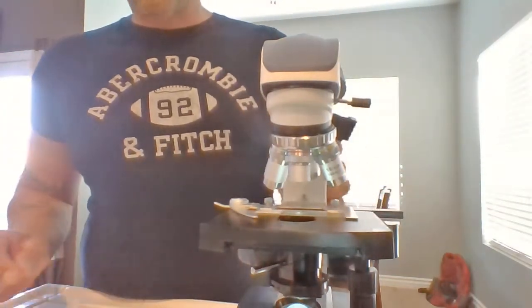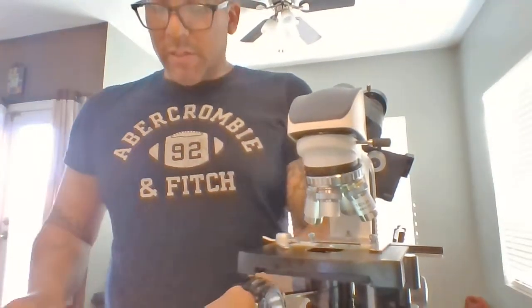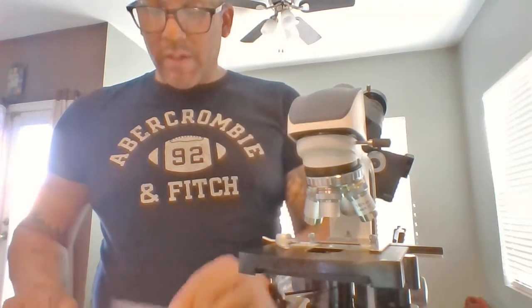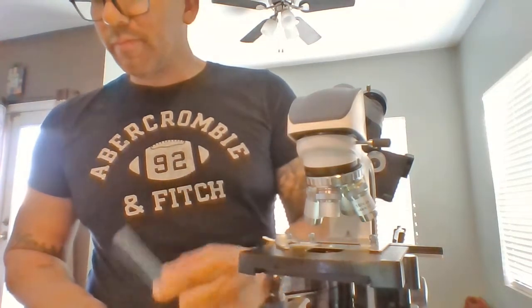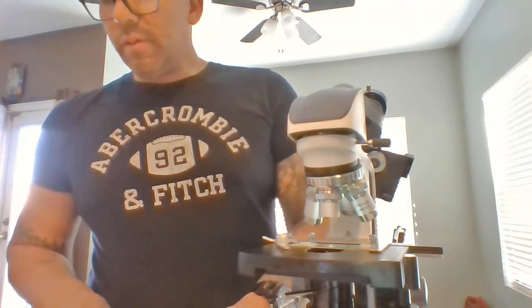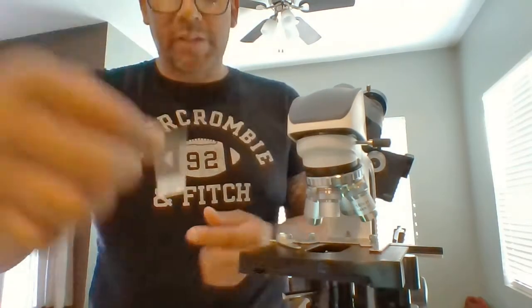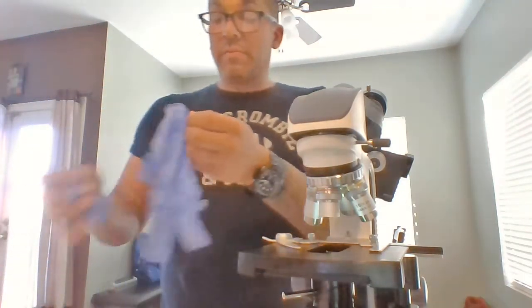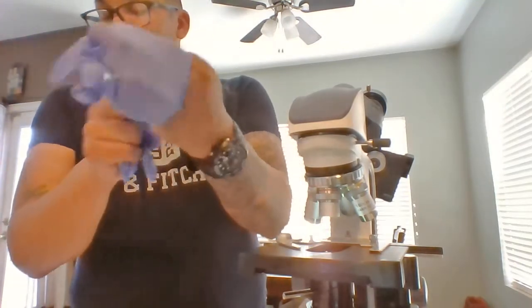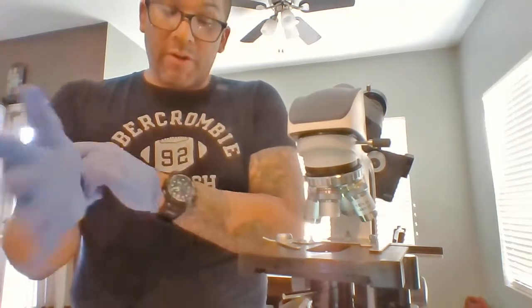Now, the last part, I'll be going over a wet mount. To do this, I'm going to gather the supplies I need. So I already have a swab, a plate, and the necessary supplies to do the slide. I'm going to remove the old slide here, and I've already sterilized my counter. I'm going to put some gloves on. So I have a pipette, some distilled water, sterile swabs, a slide, and a cover slip.